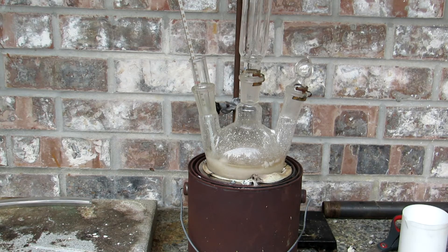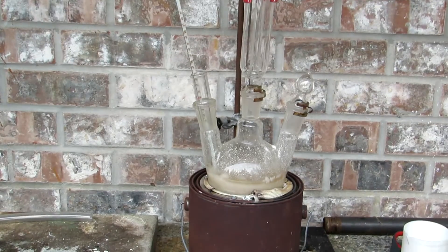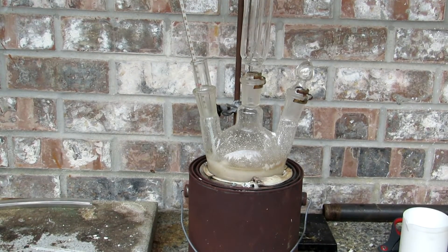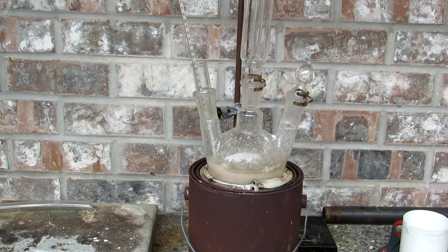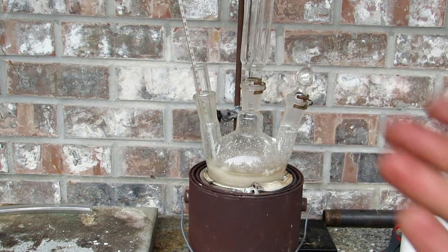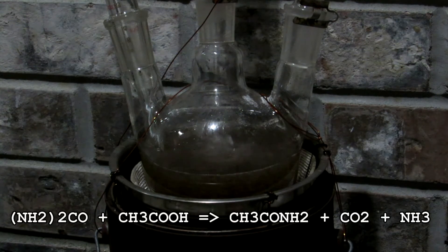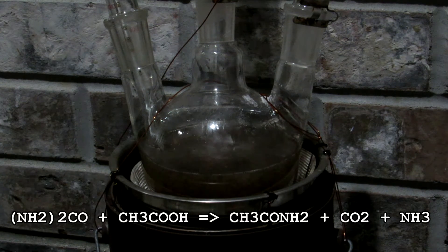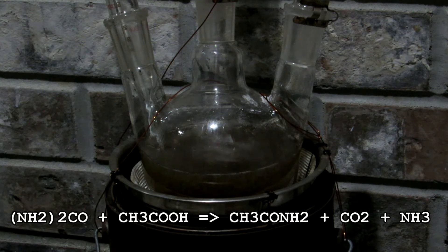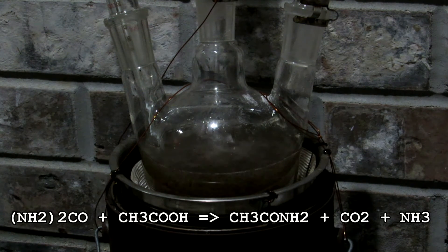An air condenser was added on top of the reflux mixture. It's important not to have water flowing through this, as water will cause the acetamide to condense in the condenser itself, which would block everything — potentially catastrophic as pressure could build up. The goal of this reaction is to get the internal temperature to approximately 200 degrees Celsius, at which point acetamide will boil and should be refluxing.